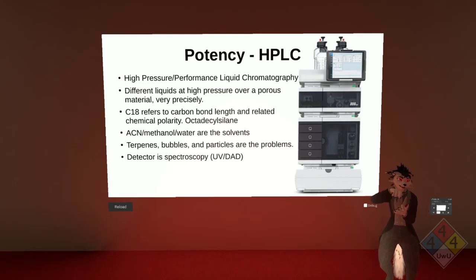So think of it as a paper towel, and then you're washing it with a different solvent each time. And theoretically, if you had, let's say, ink, it'll wash off the solvent of the ink before it washes off the particulate, the actual embedded pigment. So you're able to do, theoretically, individual components of a complex mixture one at a time.